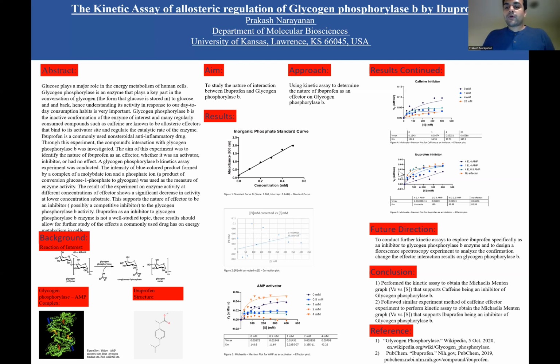On the other hand, ibuprofen turns out to be a competitive inhibitor, because as the substrate concentration increases, the enzyme activity seems to match or cross that of the run without an inhibitor. Unfortunately, data such as certain Km values and a few Vmax values do not really match the expected results, and we hope further experimentation would give more reliable data.